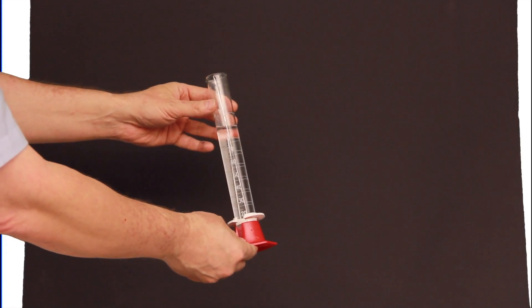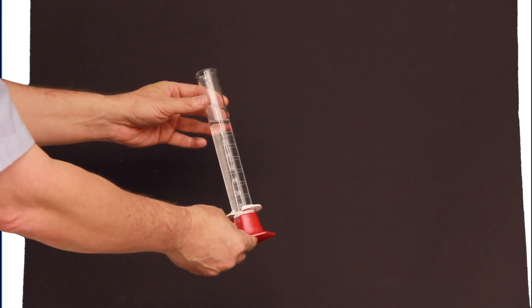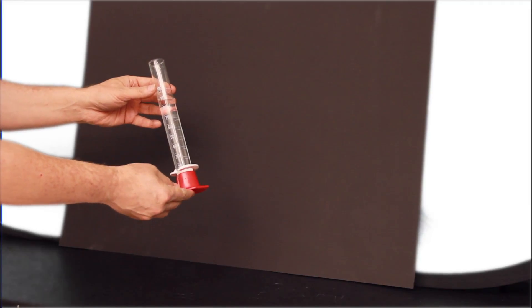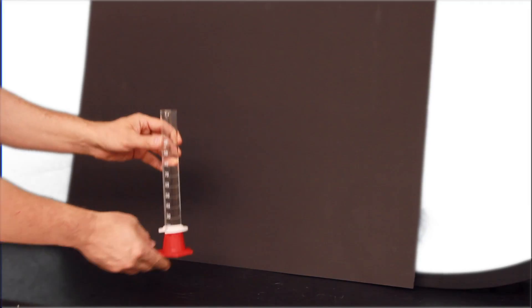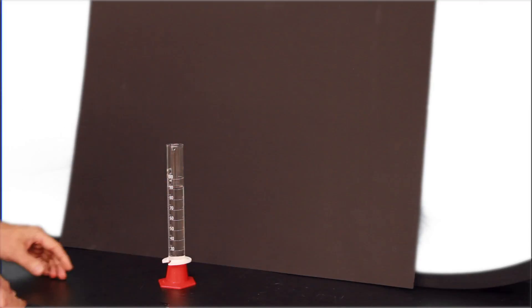Another thing to remember is to never read a graduated cylinder while holding it in your hands. This causes the meniscus to become slanted. The cylinder should always be read on a flat surface to get a proper reading of the volume.